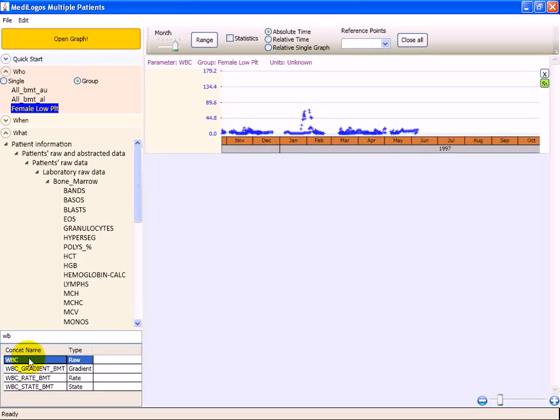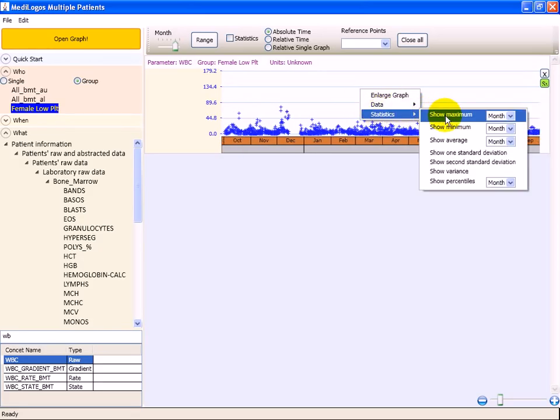The graph that is now popped up in the upper part of the screen represents all lab results. We can pan along the x-axis and zoom in and out, drilling down to the desired granularity. As the graph is full, we will use our tools to get to the desired data. This will allow us to research the data in any number of ways.